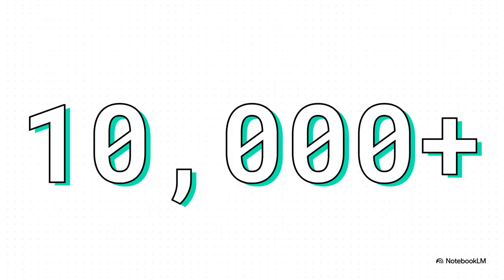The other huge factor here is just pure scale. Once the number of sequences you're working with, what we call N, starts to climb past, say, 10,000, well, a lot of standard tools just can't handle it. They just break down. They get so incredibly slow that your analysis could literally be running for weeks, maybe even months. That number, 10,000, it's a real line in the sand where you have to completely rethink your strategy.